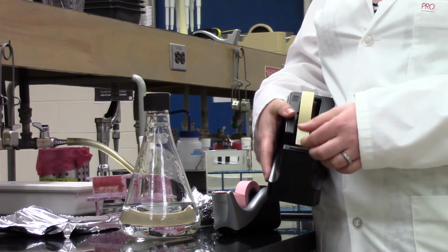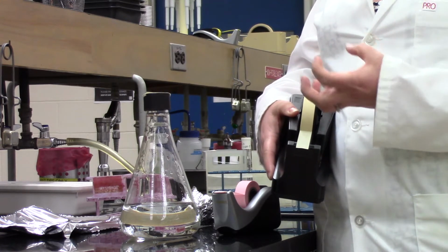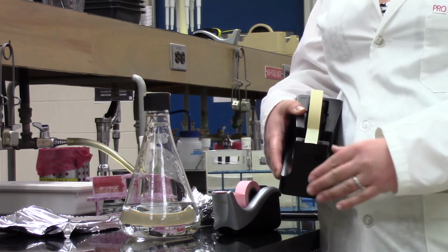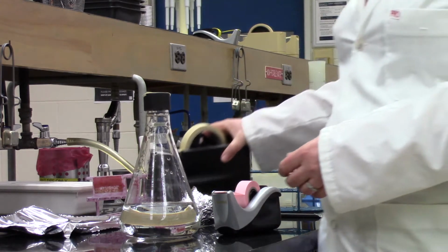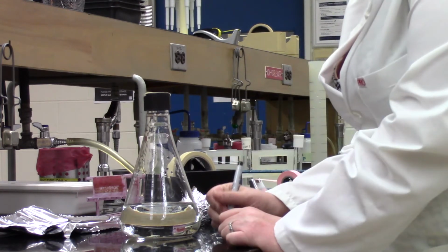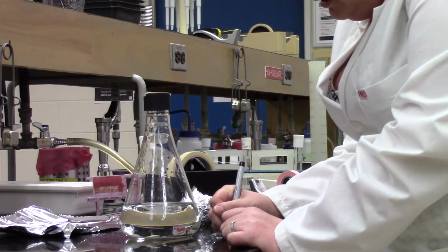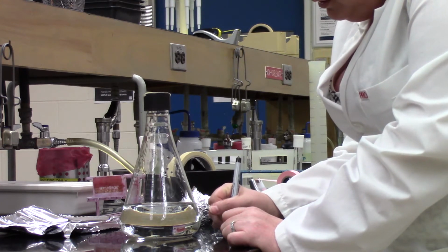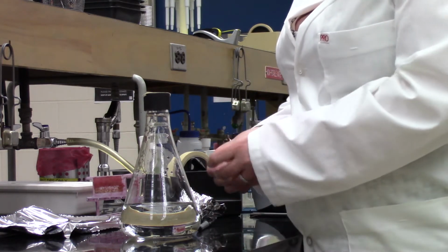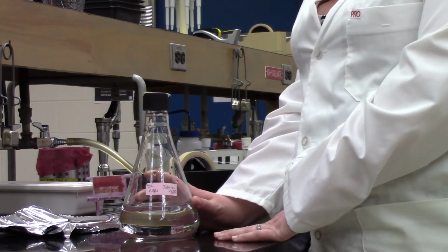So this beige colored masking tape, the adhesive on it gets really hard and extra sticky, and it's very difficult to clean if you put this through the autoclave. So don't put this on any of your materials going into the autoclave. Instead, use your lab labeling tape, put your initials on there, add on what the contents are, and also your date. And then you can just put that right onto your flask. And this would now be ready to go into the autoclave.